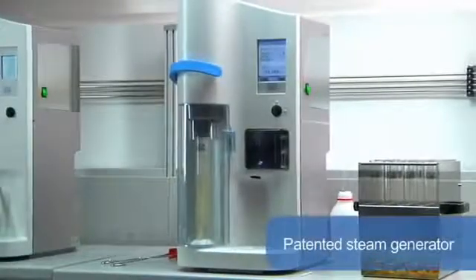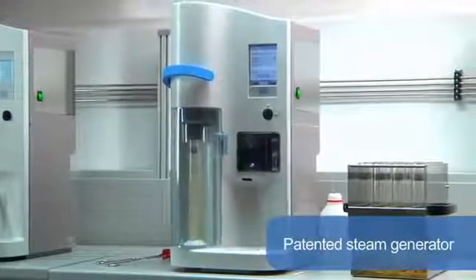With zero pressure in the chamber, this unique and patented steam generator is completely maintenance-free.